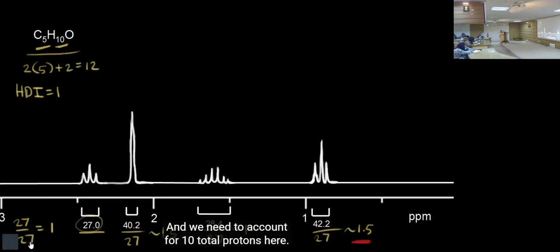Okay. So if you think that this is not one, maybe it's an impurity, right? But you know this. NMR people or NMR technicians don't have such an idea. So you can do it by yourself. You can get the FIDs, the free induction decay, and then you can process them by yourself, or you can ask them not to consider this peak and to consider this one as one.